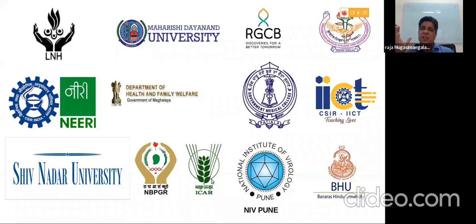You might have seen Rajinikanth movie, Robo. So we can send these robos everywhere. So whole NGS data, even if you have old NGS data, you got it from somewhere or you did it before, this is something you can now take it up and reanalyze it.